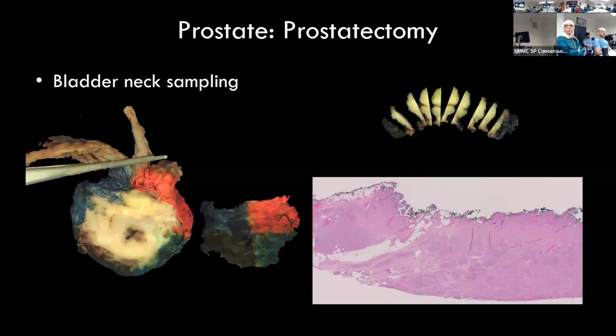So microscopically, this is how it should appear. Okay. If you're sampling through bladder neck, you should find detrusor muscles along with adipose tissue. So I know that's true bladder neck. So compact, large bundles of smooth muscle means that it's detrusor over there, okay? And the presence of fat. So if it's just going to be base of the prostate, I will not be seeing fat, and I will not be seeing these compact large bundles. I will just be seeing some smooth muscle with no fat. I know that's not going to be true bladder neck.